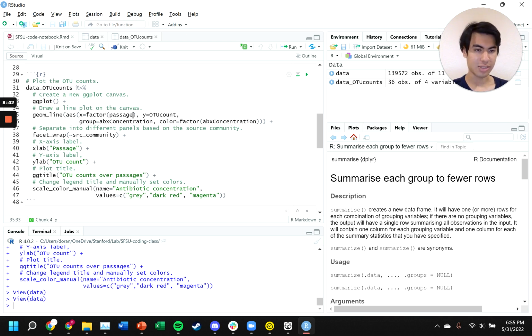This will help alleviate some of those spacing issues. Also note that you can put these arguments that you've put into aes in the ggplot call initially as well, so that they'll hold for basically every plot that you decide to draw on this same canvas.